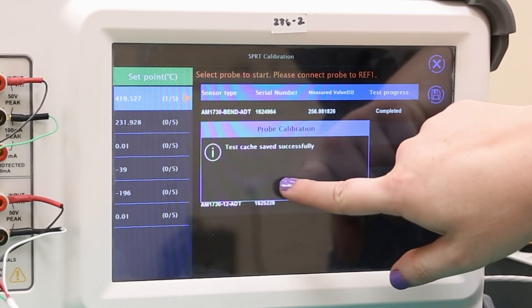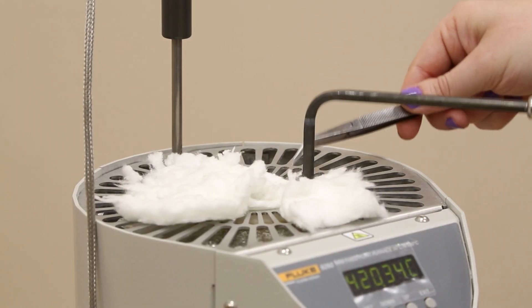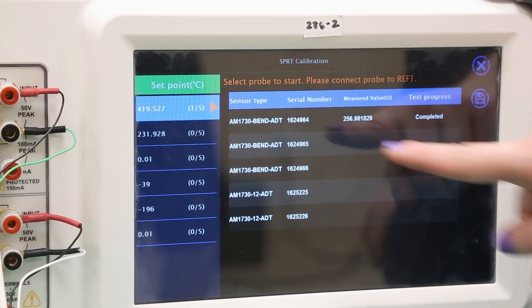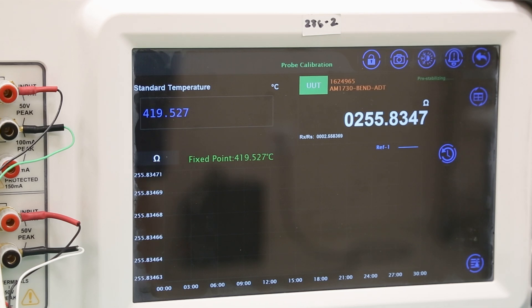Since we are calibrating the same probe types, we can swap between them using the quick connector. Now we will move the new probe to the active position on the zinc cell. Return to the 286 and select the second probe to begin measurement. These steps can be repeated for the rest of the probes.